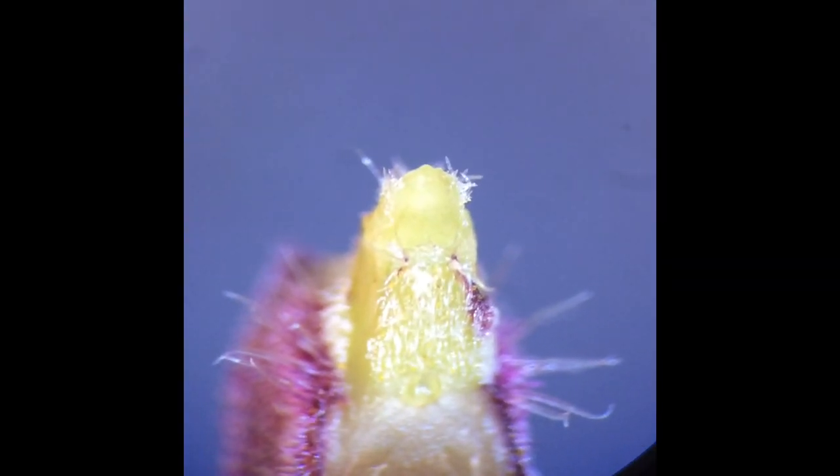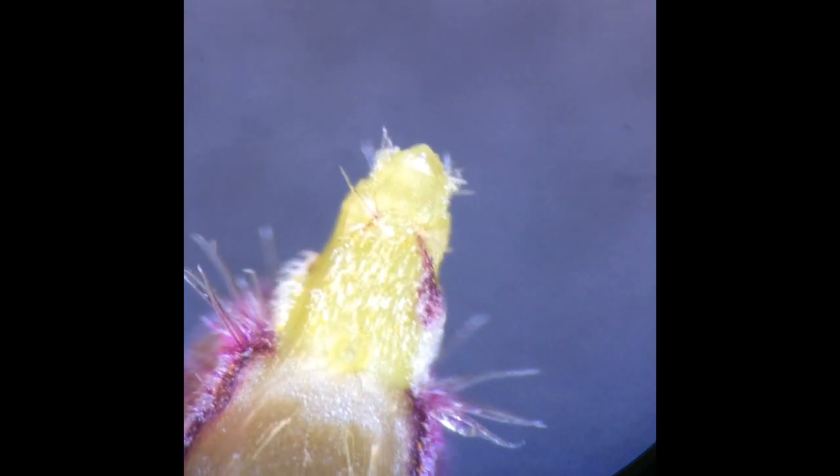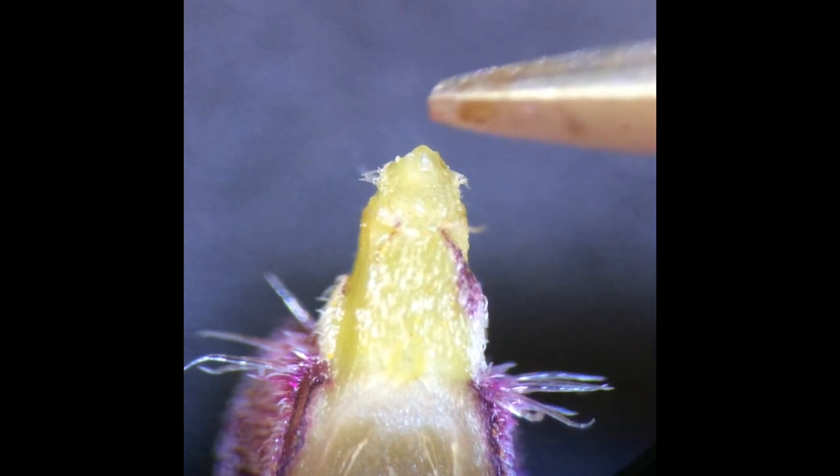Now, we have reached the shoot apical meristem. I am gently touching the shoot apical meristem to point it out.